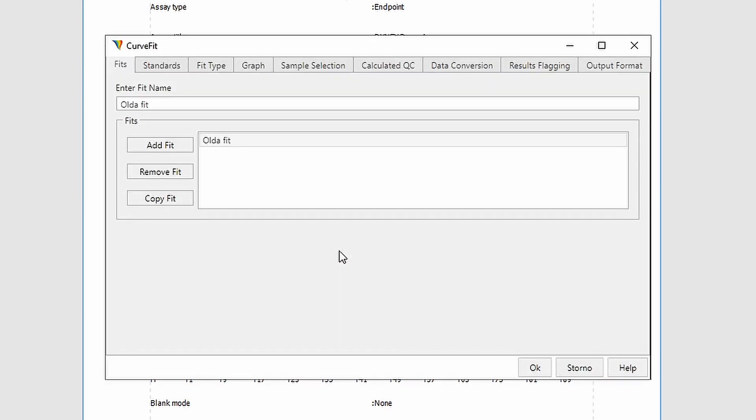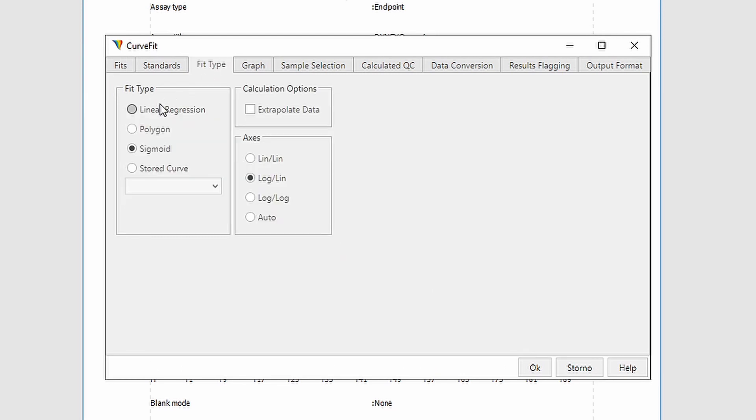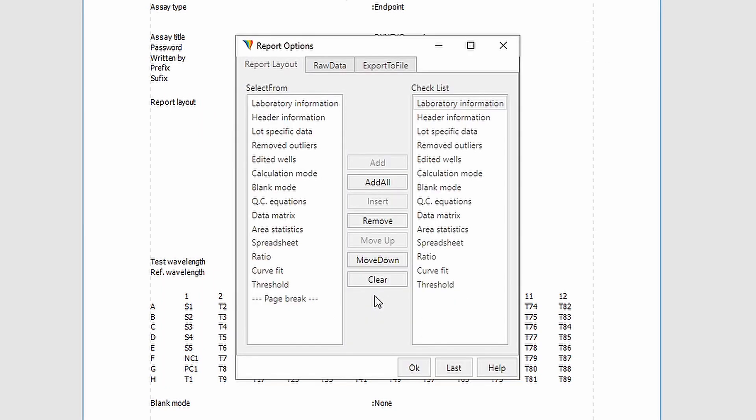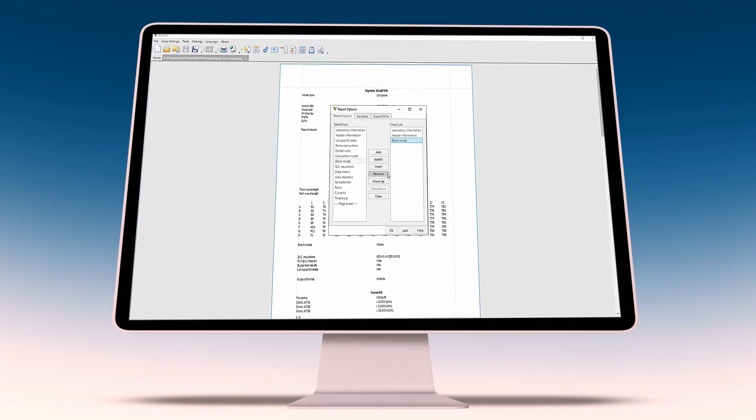For quantitative assays, there is a wide variety of curve-fitting tools. You can customize your report and export data to the laboratory information system.